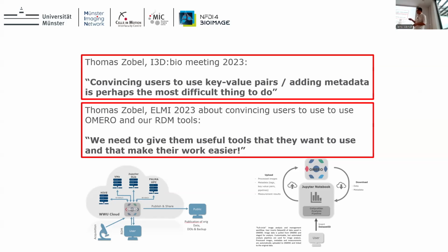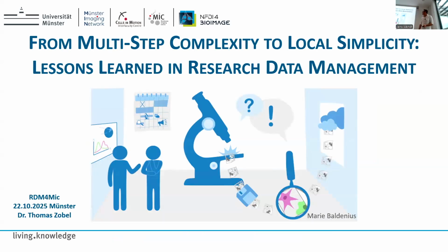But this was all already done in 23, but it didn't work out that PhD students really annotate their data and use it. OMERO is coming more and more. So if they learn it, they want to use it, they first come into contact, that's not the point. But at the moment, we have the problem that people are not annotating their data quite well. So therefore, we were looking for some strategies.